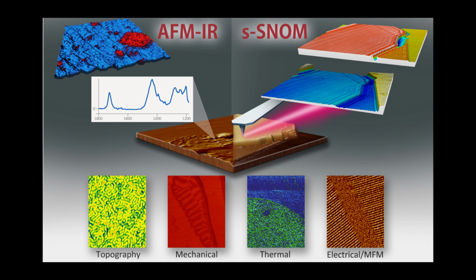And in principle, it's possible to quantify mechanical properties from the contact resonance, and there have been a number of publications, for example, from the NIST group, and there's a nice webinar recorded at our website by Donna Hurley, who talks about some of the quantification efforts.